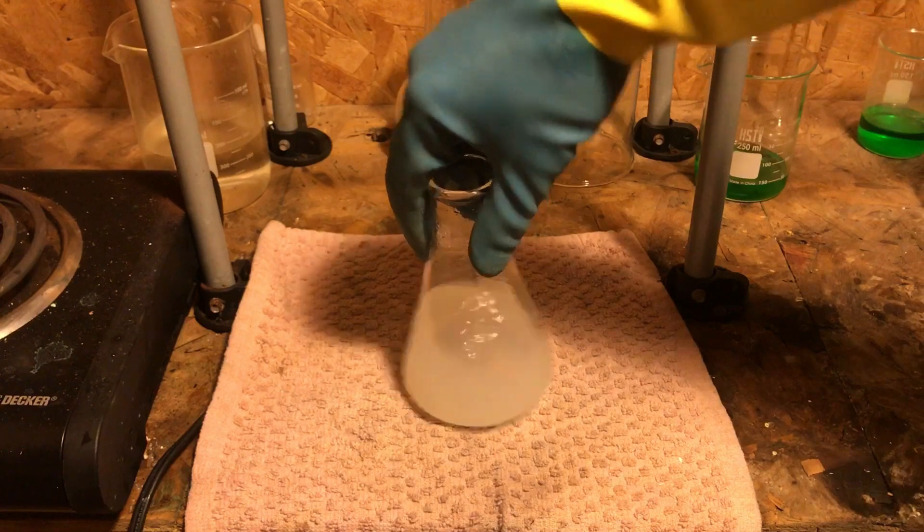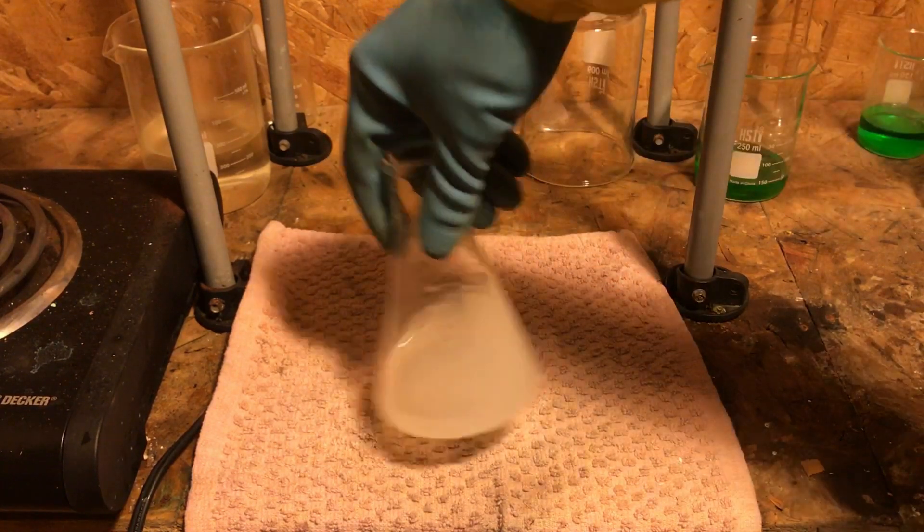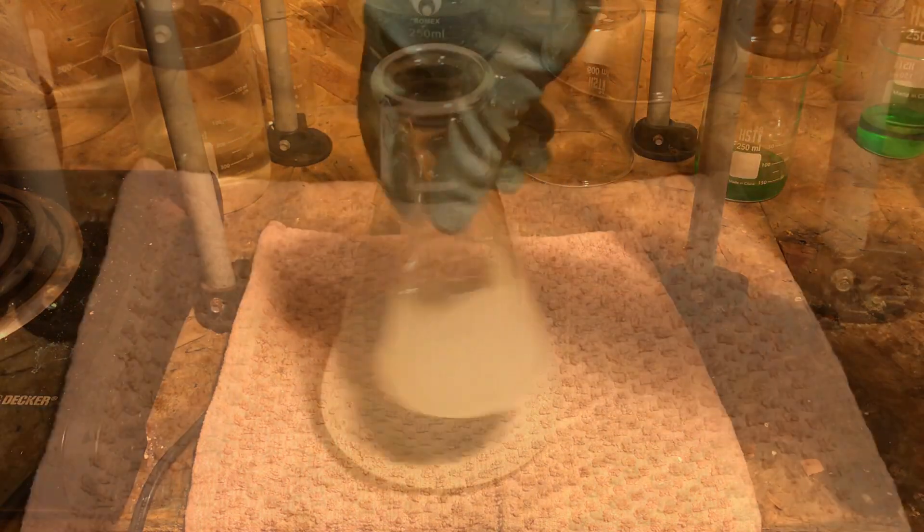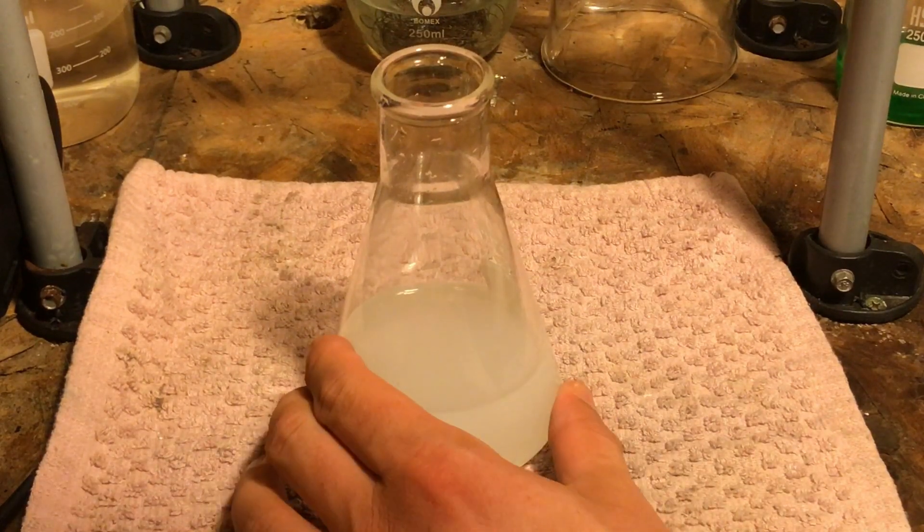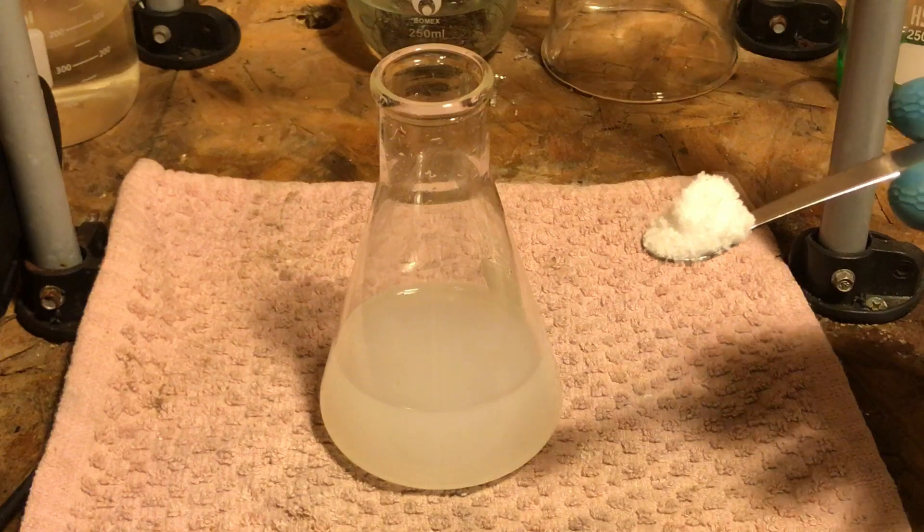We should have a solution containing silver ions, along with the nitrate ion, NO3-. Now, to the solution of silver nitrate, I'm going to add sodium bromide.